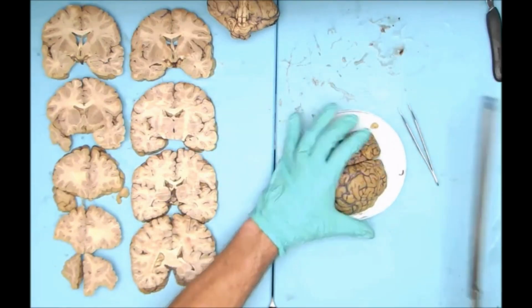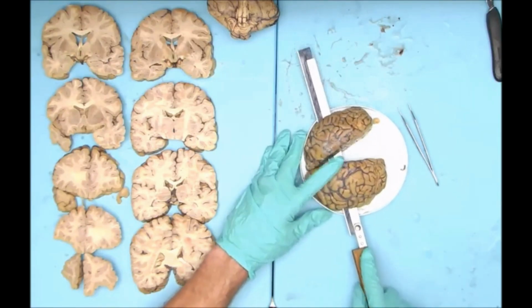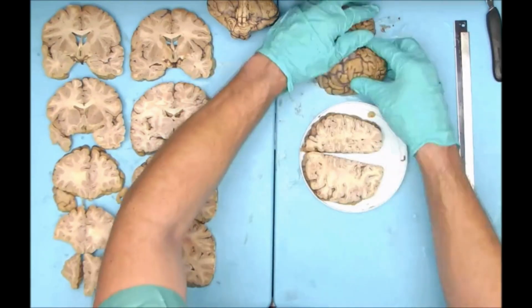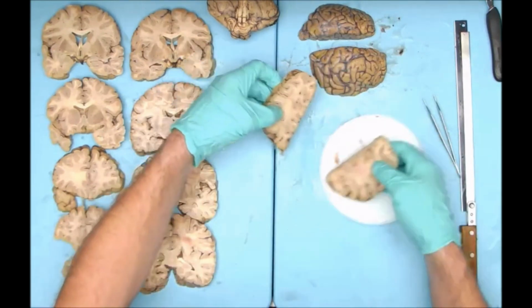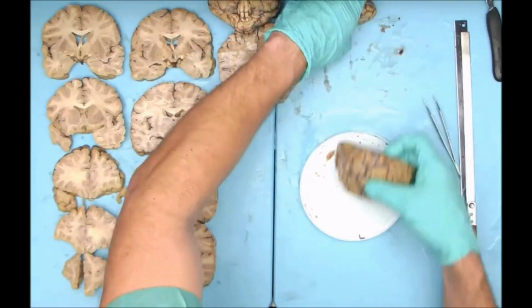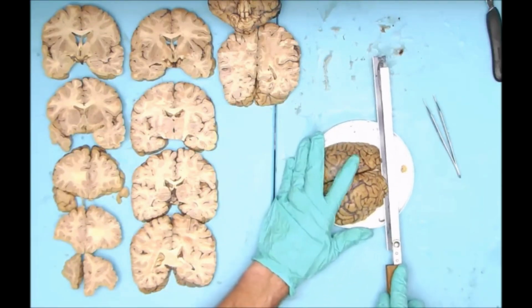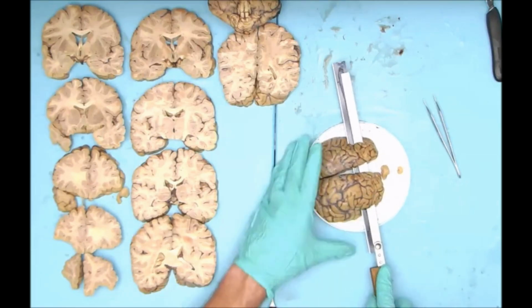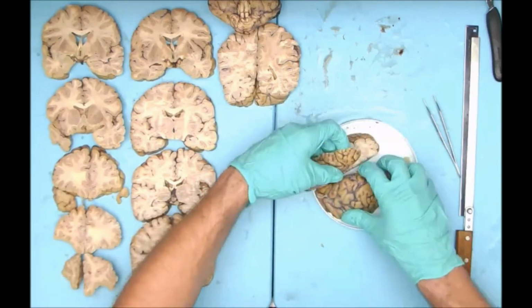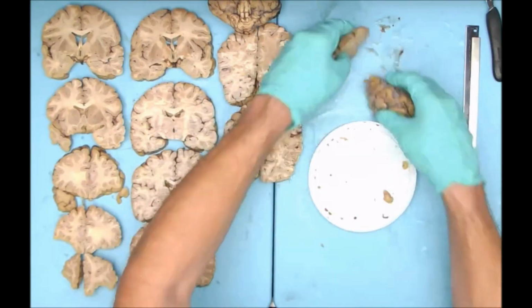So I'm just continuing my slices and laying them out. And you also have the option, if you are worried about the laterality, you can always throw a little bit of ink on one hemisphere of the brain, the right side or the left side, especially when you first start doing these type of brain dissections.